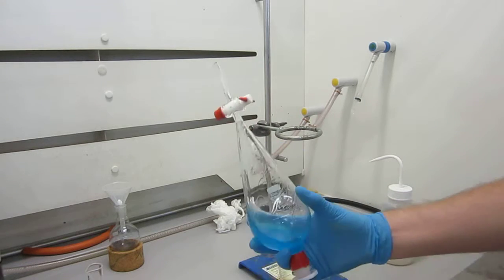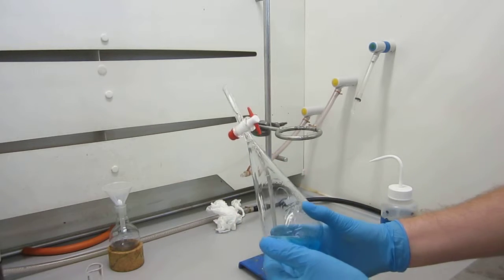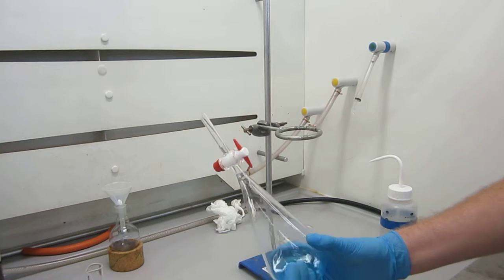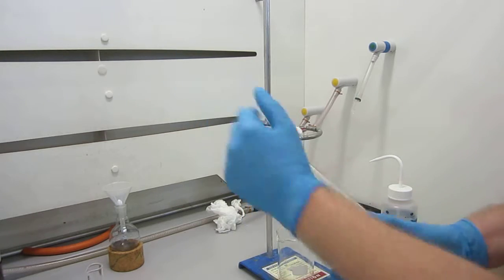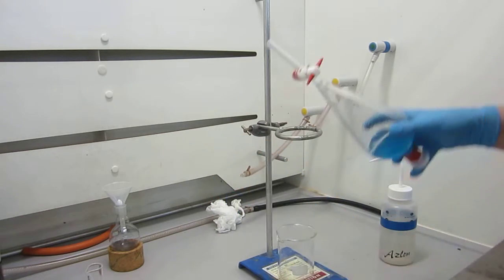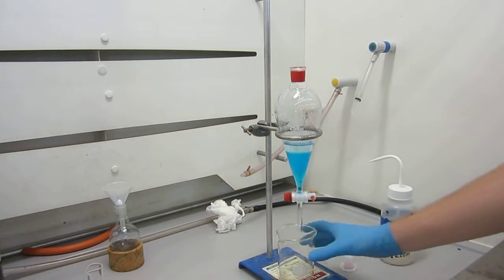And you don't want to be holding it unvented for more than about 5 seconds at a time, because depending on the combination of reagents you've got in here, you can form a lot of gas, especially if the solution is still warm from your reaction. So you want to have this vented as much as possible and vent it in a safe direction. So I'm happy with that. Once you're done with it, close the tap, place it back into your separating funnel ring, and take the bung out the top. Okay?